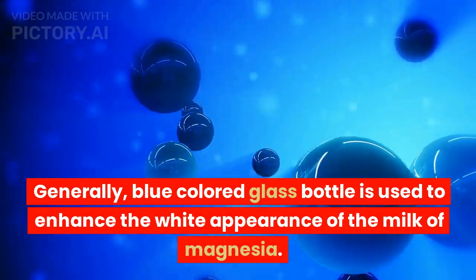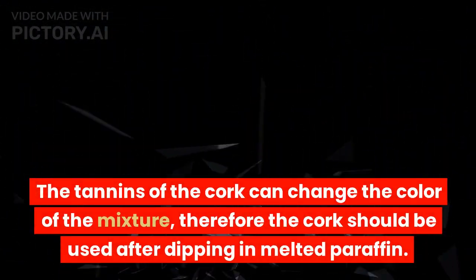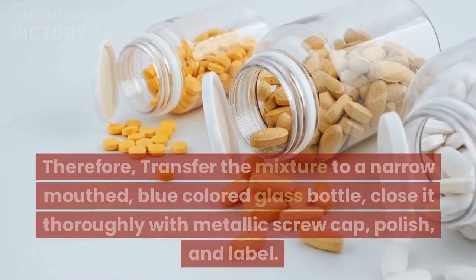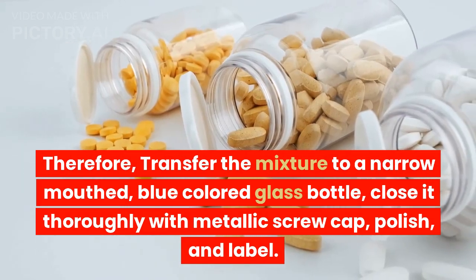Generally, a blue-colored glass bottle is used to enhance the white appearance of the milk of magnesia. The tannins of the cork can change the color of the mixture; therefore the cork should be dipped in melted paraffin before use. Transfer the mixture to a narrow-mouthed, blue-colored glass bottle, close it thoroughly with a metallic screw cap, polish, and label.